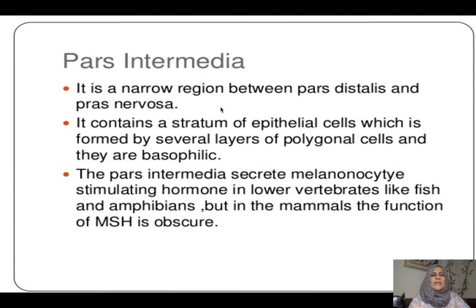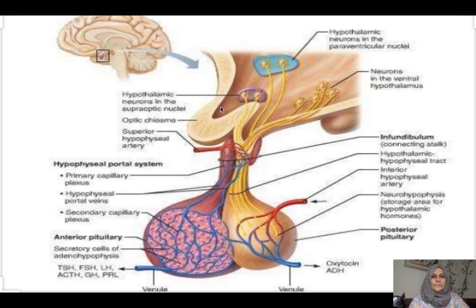هذه هي البارس انترميديا. البارس انترميديا يتميز بأنه يتكون من الراثكي cysts which is a characteristic feature of this region lined by simple cuboidal containing colloid material يعتبر عبارة عن remnants of the Rathke's pouch اللي هو امتداد مال الإكتوديرم مال البارس ديستالس.